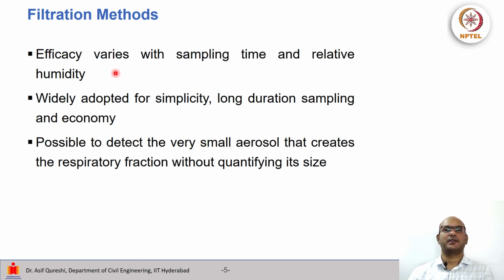The efficiency of the method, as we can gauge, varies with the sampling time and the relative humidity. This kind of method is quite widely adopted for simplicity, because we only need a filter, a filtering mechanism, and a suction pump, and then we will be able to filter the air onto the filter media.